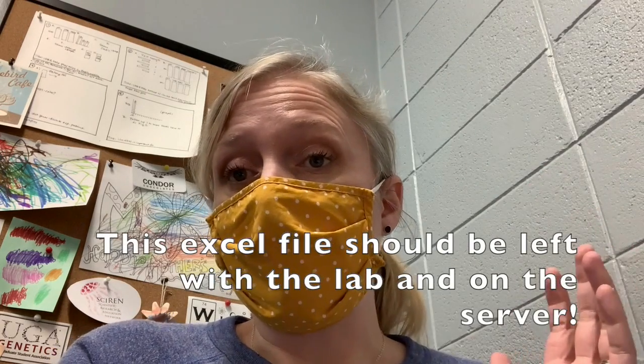So first column is just a number. Second column is the gene name. The third column is the gene identifier. The fourth column is PJC 53.2, which would be the same for most of them. Then you might have the date, and then you would have the primers if you have that information, and then you would have the sequencing information as well, or the file where that sequencing is.